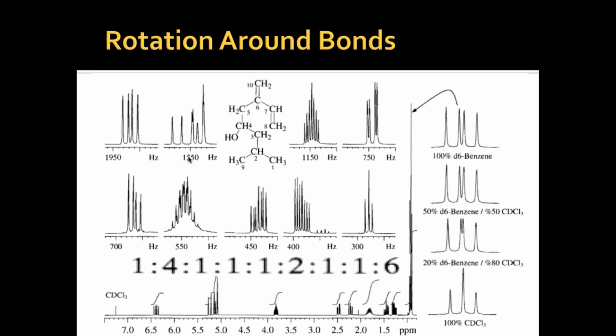So what will happen? You have the hydrogen here, you have the hydroxy group here, right? The hydroxy group present in the methyl group. Now, because of the close vicinity of the methyl group, that's the reason maybe the splitting will be different.